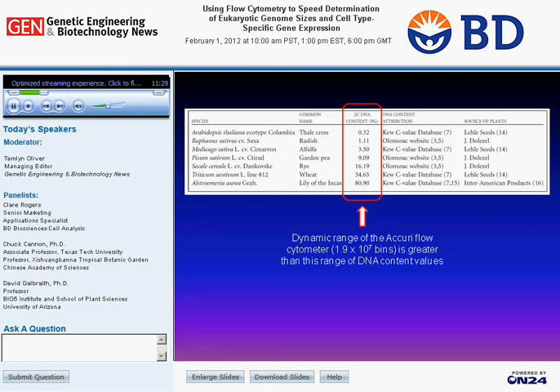The next slide tests the ability of the C6 flow cytometer to analyze the full range of plant DNA contents in the lab. We selected a series of plant species, Arabidopsis thaliana, which has a 2C DNA content of 0.32 picograms, going all the way up to Alstroemeria aurea, lily of the Incas, which has about 81 picograms of DNA per 2C nucleus. And then we took these and we measured them using the C6.